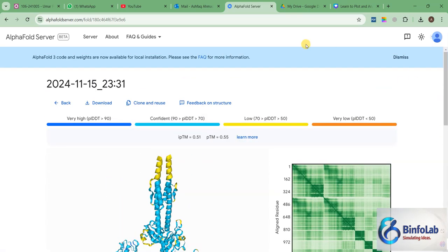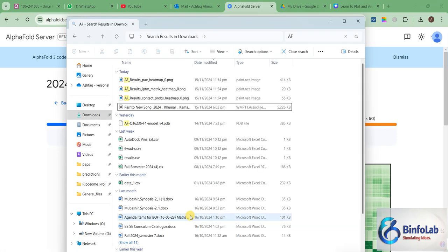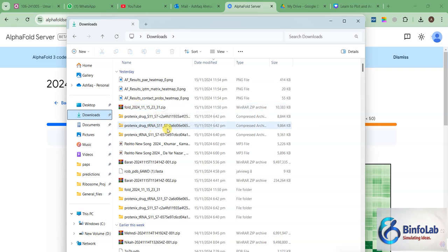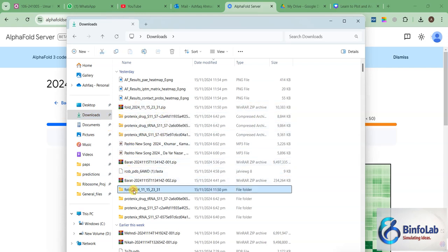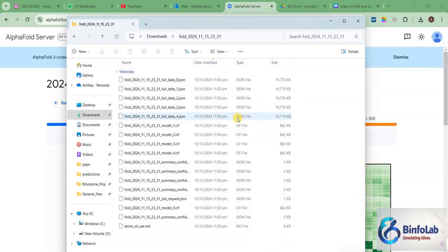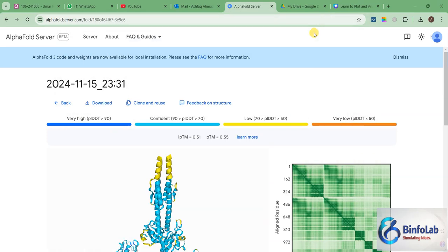Now from here when you click download you can download these results and I have already downloaded it. So let me show you my download folder - you can see this is the downloaded results. Then I unzipped these results and this is the result file where I can see some JSON files, some CIF files. And all these files contain the information about these things. Let's assume you have used the server and downloaded your results. What is next?